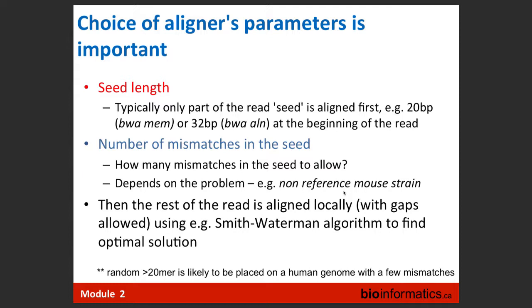But it's true that the incremental gain of the last bases is small. Once you're at 100, mappability is 92, 93%, so you gain only a little bit more. I will talk a little bit about this. But I think the cost of sequencing now is just determined by the Illumina kit, right? So we're not sequencing short. That's different, but we are still using 32.